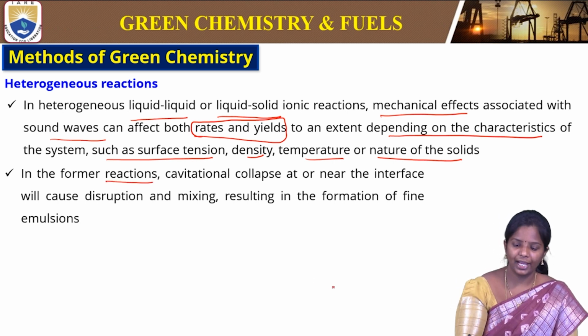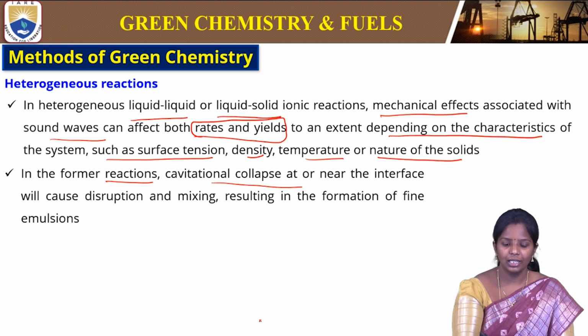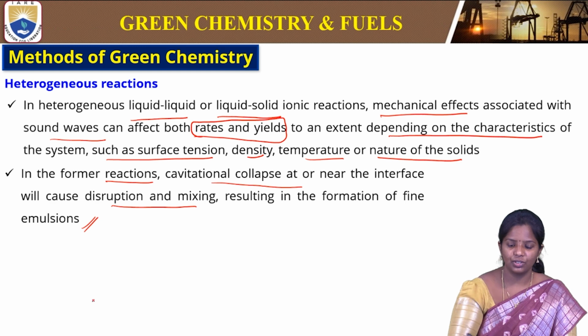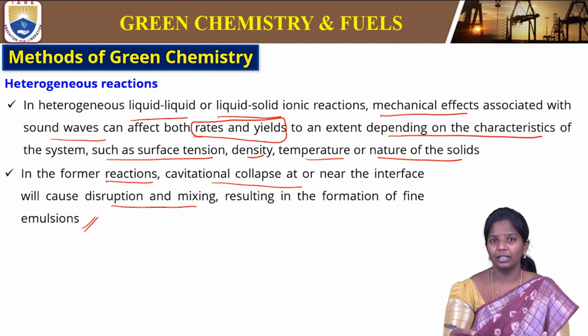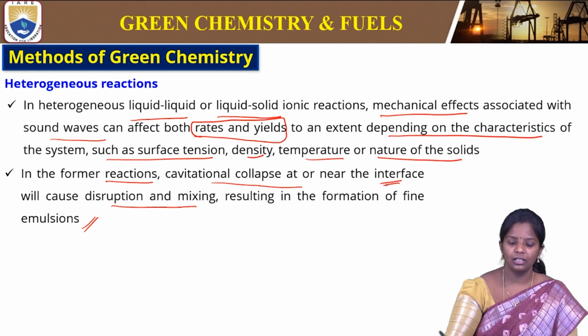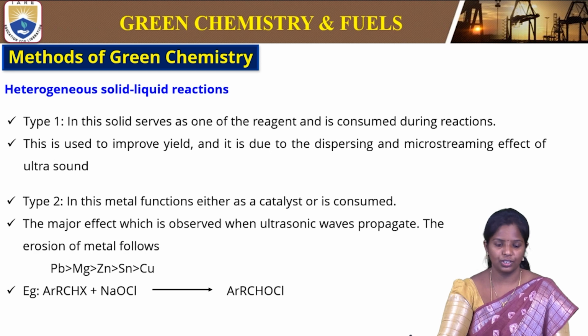In the former reactions, cavitational collapse at or near the interface will cause disruption and mixing, resulting in the formation of emulsions. So what happens? The bubbles, after forming and reaching their unstable stage, will collapse. This will produce energy at the interface, giving rise to a mixing phenomenon, forming emulsions of those particular solutions.